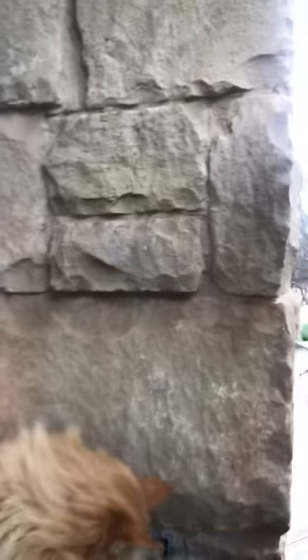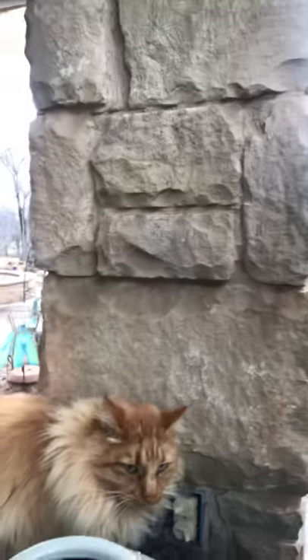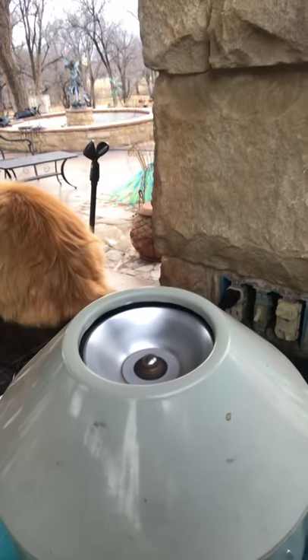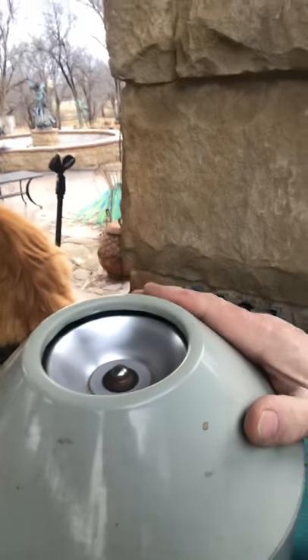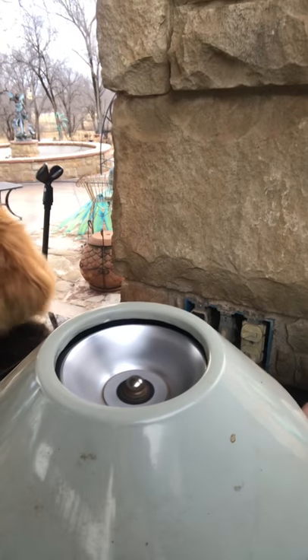I'm going to plug it in on the fastest setting. And off it goes — it's spinning. I'm going to run that for a couple of minutes on the fastest setting. You can't hurt the blood spinning it this fast.